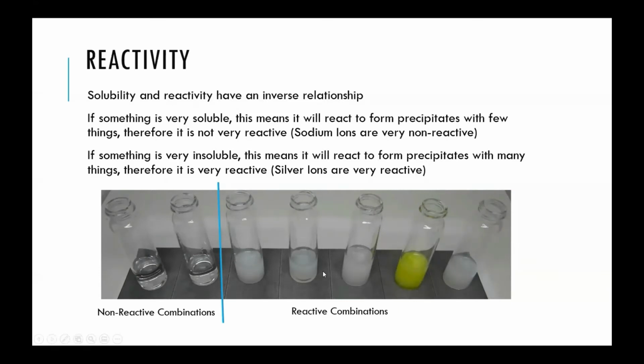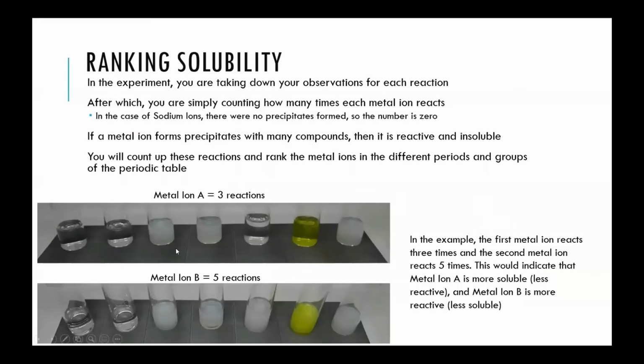This experiment is a qualitative experiment. You are just looking at overall patterns. You're not focusing on the specific values and amounts, but the overall trend, and the trend within the periodic table. So how you'll rank the solubility and rank the reactivity is by looking at how many reactions something undergoes.